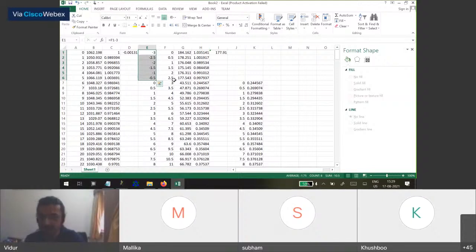Is that clear? Yeah. And how have you pasted this into the J cell from? So what you do is you first select all of the regions. You press Control C to copy, and you do a special paste, which is paste here on the top left, and go to category.